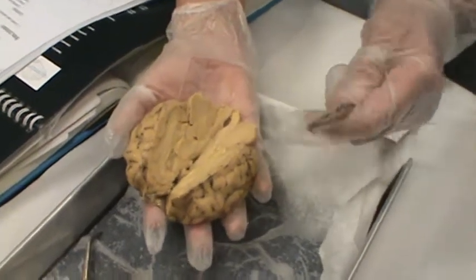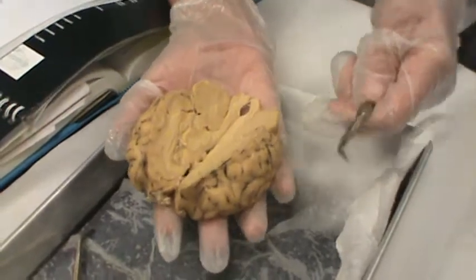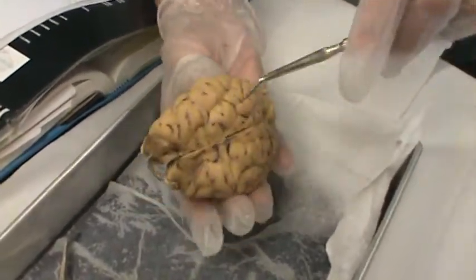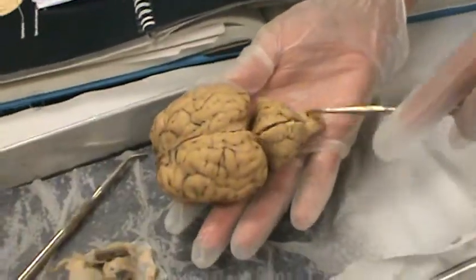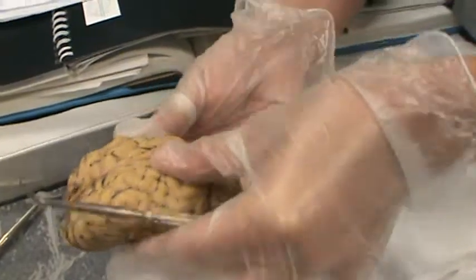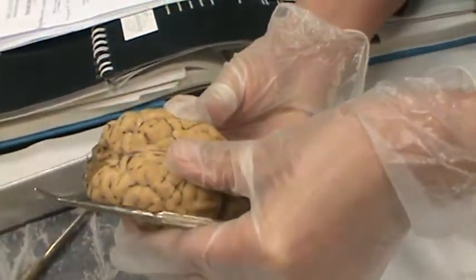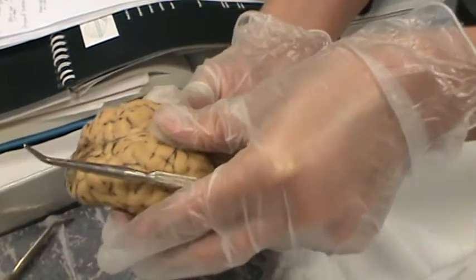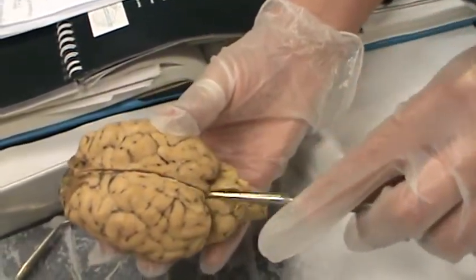Okay, this is the brain structure of a sheep. First is the cerebrum, and this is the cerebellum. Now we're going to go to the cerebral hemispheres, which are the left and the right. The great longitudinal fissure is the division separating the left and right of the brain, which is this.